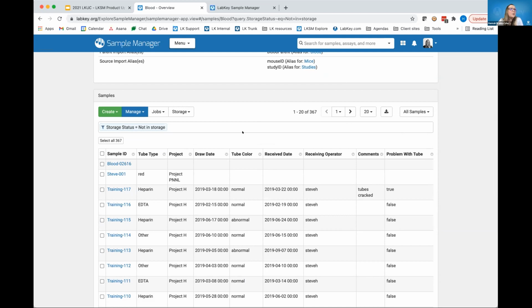Why are there so few medical cannabis samples? Well, I think somebody just created this in our fake LabKey lab. And so you really have the option to create as many samples as you need to accurately reflect the science that you're doing in your lab.